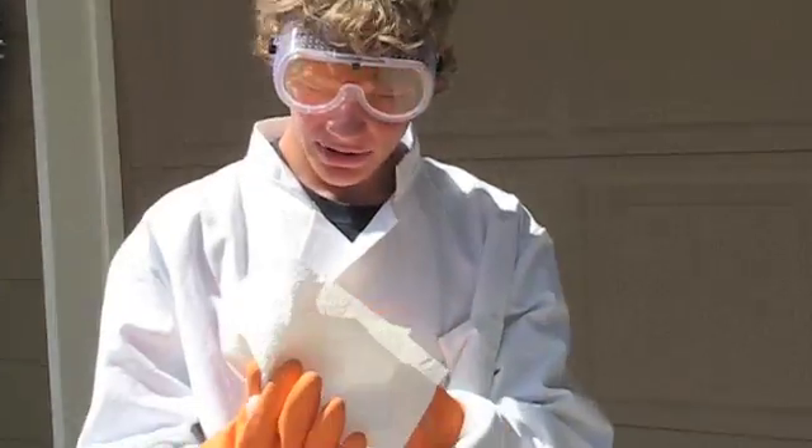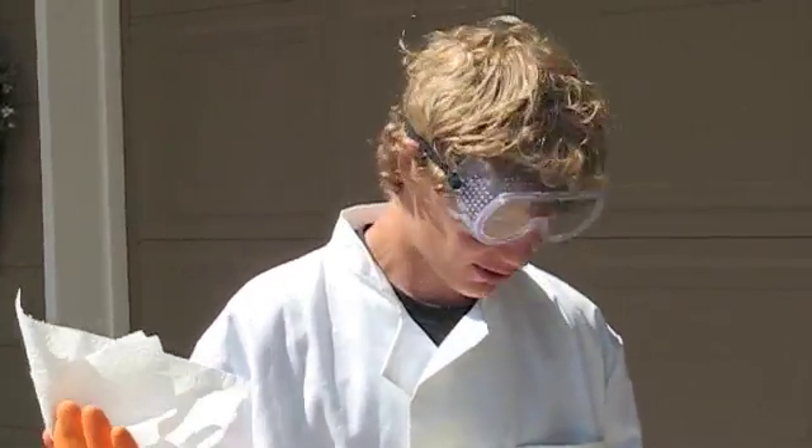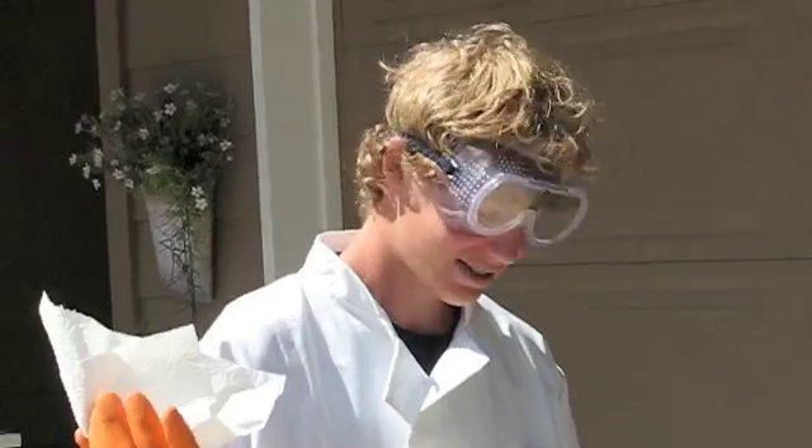Hey, I'm Colin, and today I'm going to show you a pretty cool reaction. Right here in my hand, under this paper towel, I have a piece of elemental sodium, a metal which is extremely reactive — and it's pretty cool because if you throw it in water, it'll explode or catch on fire.